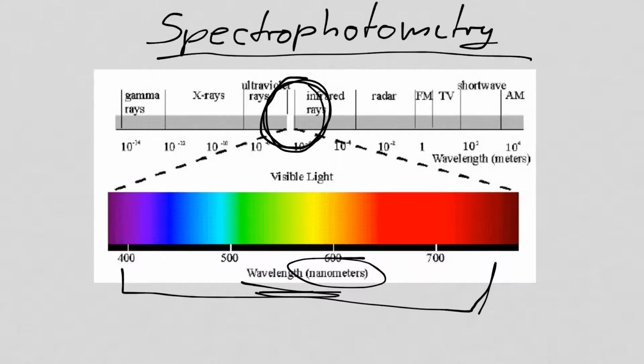So that is bluish purplish light. And it has a certain energy, very distinct characteristic energy. And only at this wavelength, the electrons of the paranitrophenol are excitable. Okay? That makes sense? Yeah, it's pretty simple.